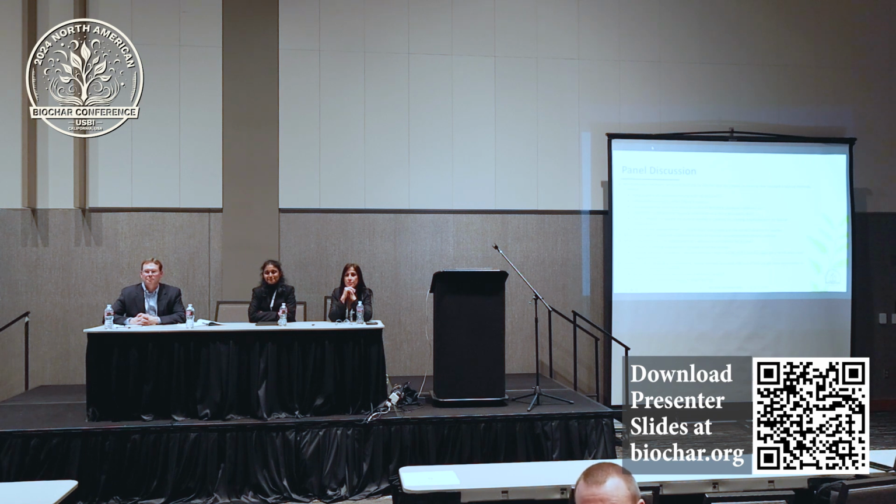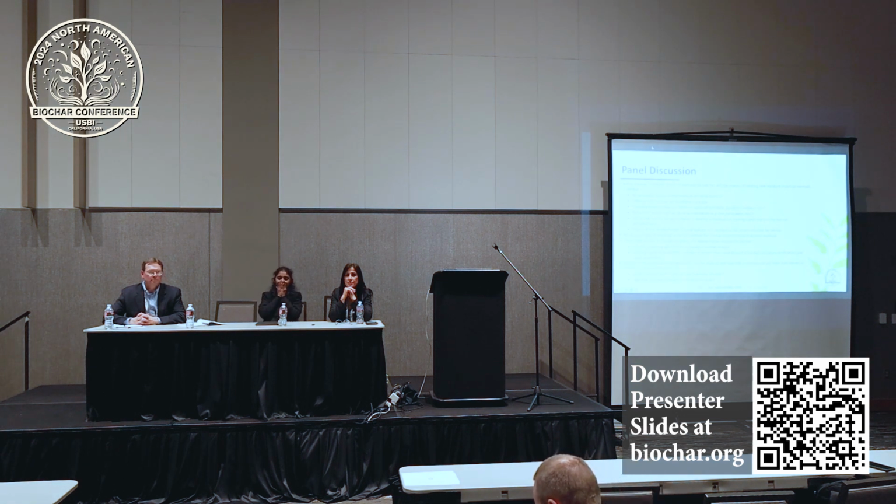So just two comments. First, on the H to C ratio, a lot of it comes down to the equipment that's being used as well. A lot of HCN analyzers utilize very small volume samples. So sampling procedures and standardization on that, making sure you have a robust sampling and milling protocol, that you're getting those down into a fine powder that can be analyzed.